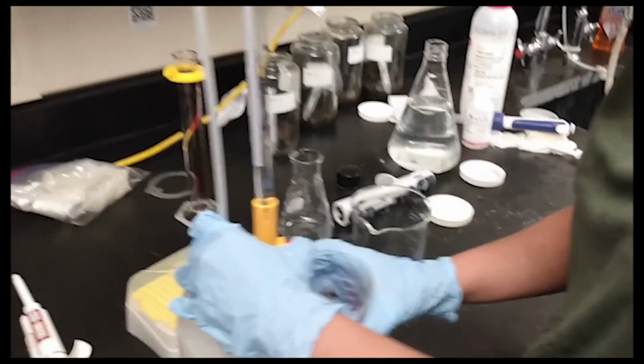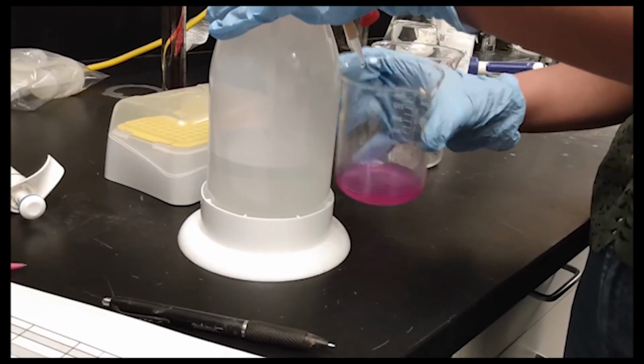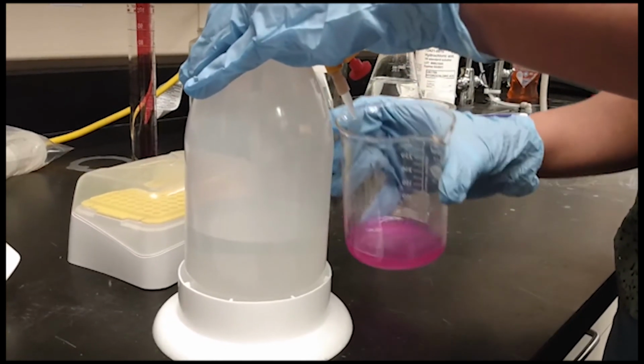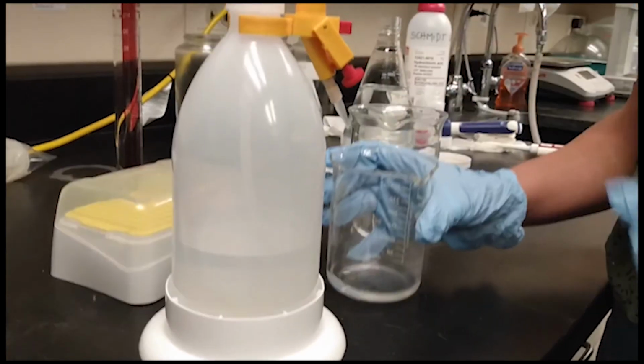We use this very basic chemical approach, acid-base titrations, to measure biological activity in soil. And that's what we've been up to in the last few weeks here at the Schmidt Lab.